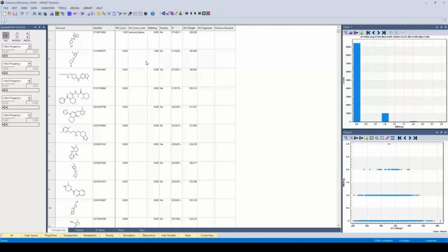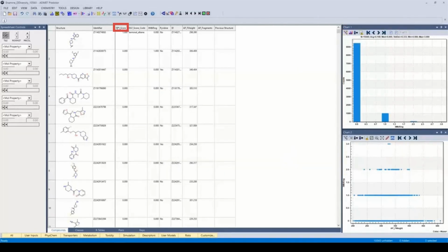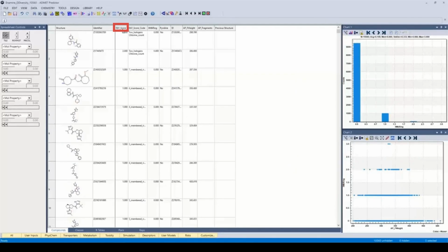Okay. And if we want to have access to these compounds, we can follow a similar process to what we've done earlier. First thing is we may want to know what's the range. So in this case, the compounds are doing really well, and probably similar rules were applied in the elaboration of this collection.